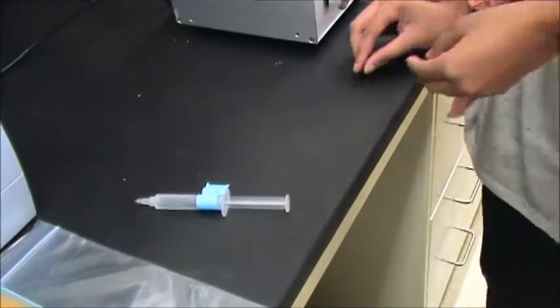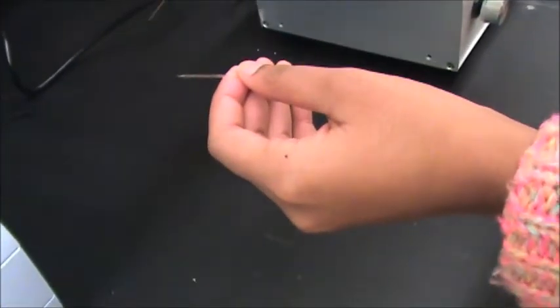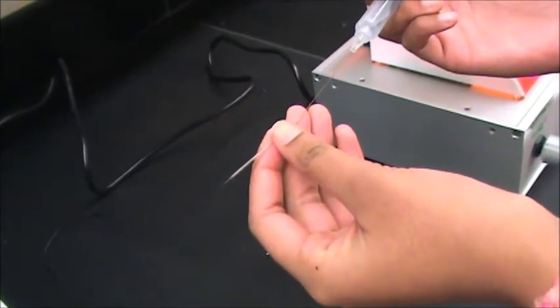So now we're going to put in the 3 molar potassium chloride, and the important thing is to not let the potassium chloride drip over the end, so it won't get in the saline and affect our experiment.